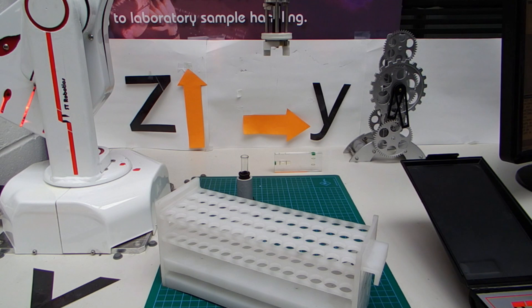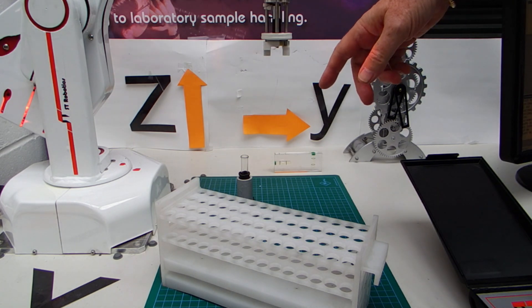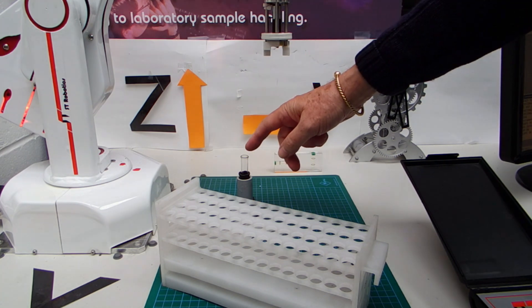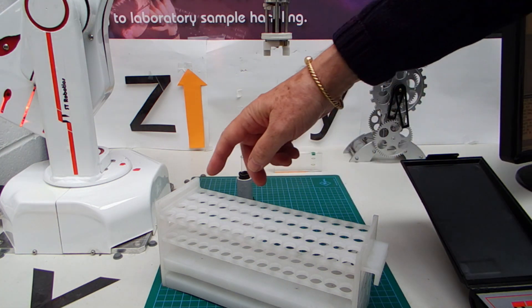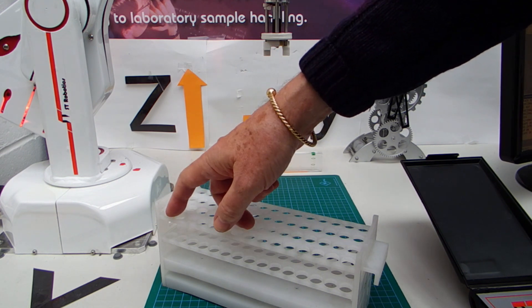I would now be able to pick up a tube from a pre-programmed position called holder — I've already programmed this before I started. I can pick up the tube and put it in any one of these positions from one to sixty. One is here, fifteen, thirty, forty-five, sixty.